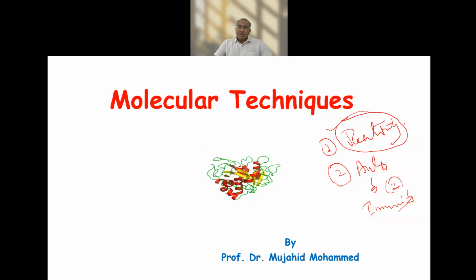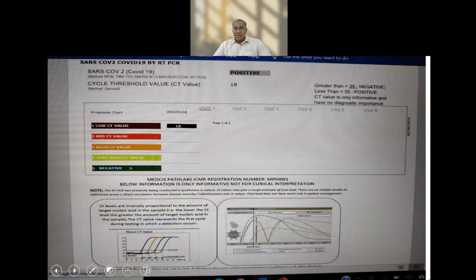Now, what are the main molecular techniques? We have plenty of molecular techniques we are going to learn. Part by part, I am going to teach you about these molecular techniques. Today, we are concentrating much more on what we call a report. You could have seen this. It is generated by the computer with one molecular technique, which we term RT-PCR.